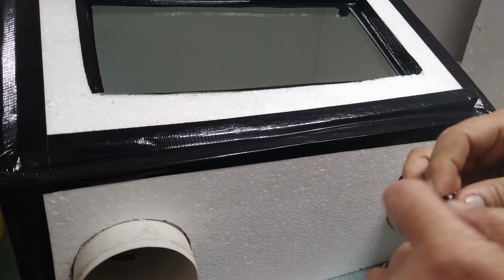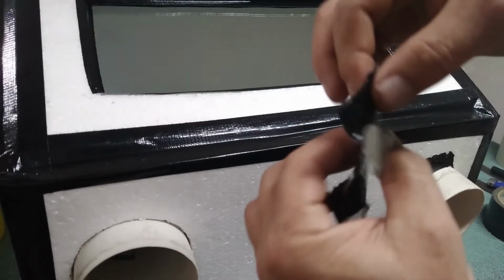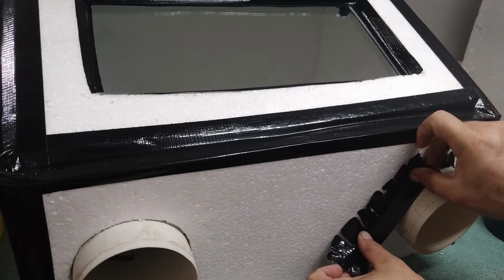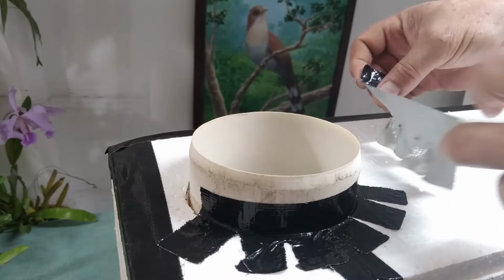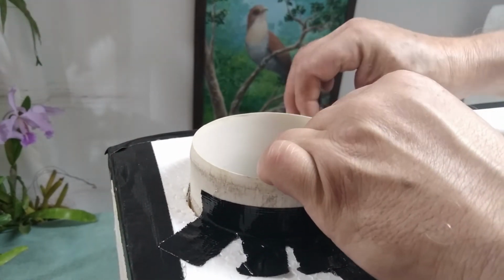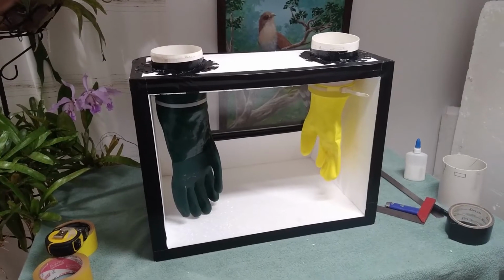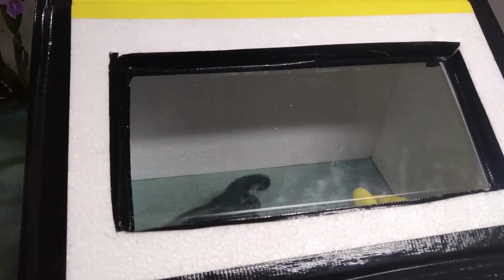Cut pieces of tape halfway through its width several times so you can embrace the PVC and still have parts to glue onto the foam wall. Make sure you close and eliminate all the gaps. This is not the time to be economic with your duct tape. You don't want any air leaking here. In the end, this is how your box is supposed to be looking like.